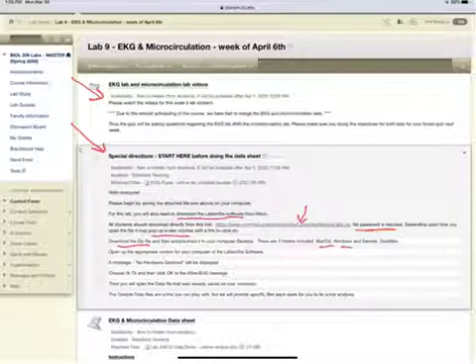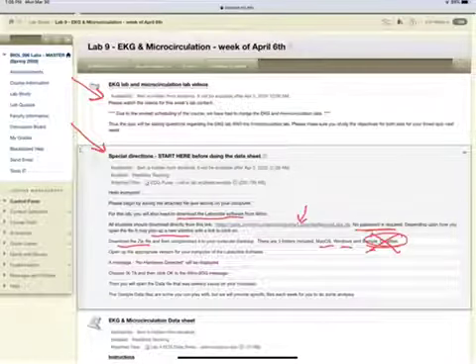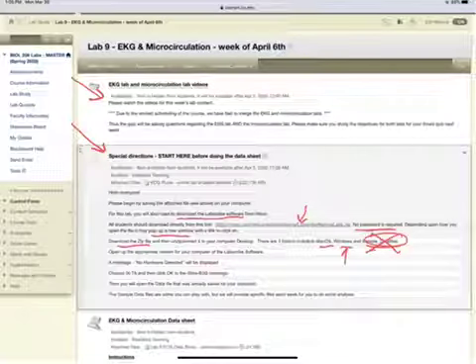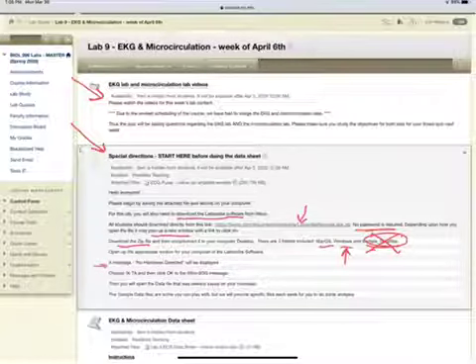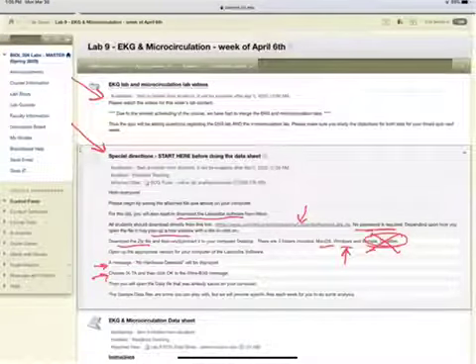We've got Mac, Windows, and then these sample data files. You can ignore those sample data files for now. We'll need them a little bit later, maybe. So whatever is appropriate. I have a Windows-based computer, so I opened that one. And then this says, follow these few steps right here. You're kind of used to clicking OK when you open up LabScribe.